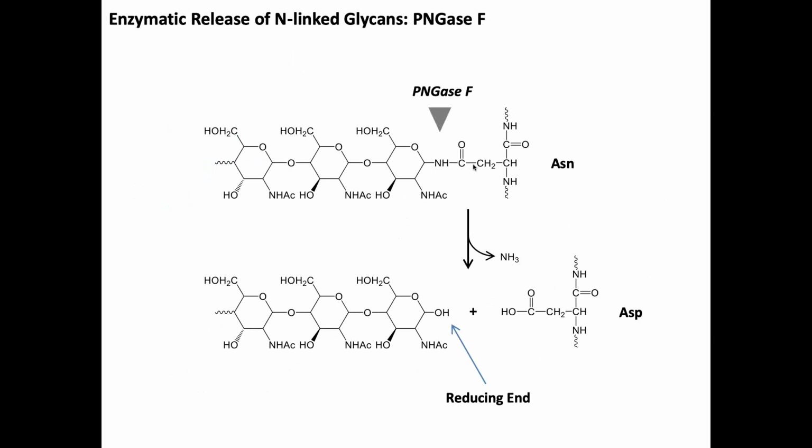Okay? But this was the standard workflow. You basically hit with PNGase F, release it. Now you have this 1 Dalton increase, and you're looking for that in your data set to see if there's an aspartic acid that should be an asparagine, and it's in the motif, treated with PNGase F, therefore it was N-linked glycosylated. There are a lot of papers that focused on that 10, 15 years ago or so.